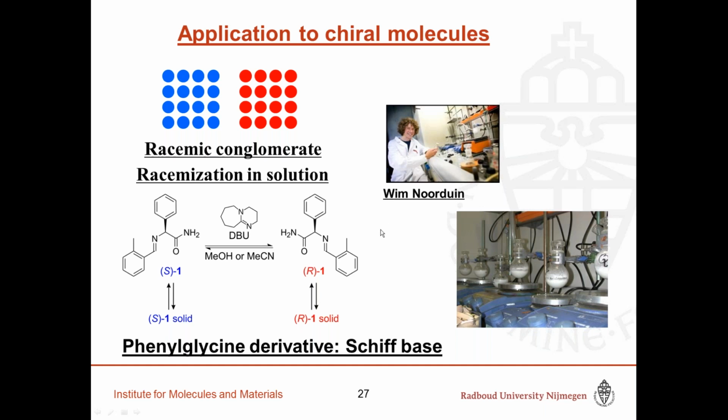Wim Noorduin was the one who did these experiments, and you see it's a very simple experiment. You only need a stirring device, a magnetic stirrer in the solution, and you already see this milky solution because you are grinding the crystals towards very small crystallites.